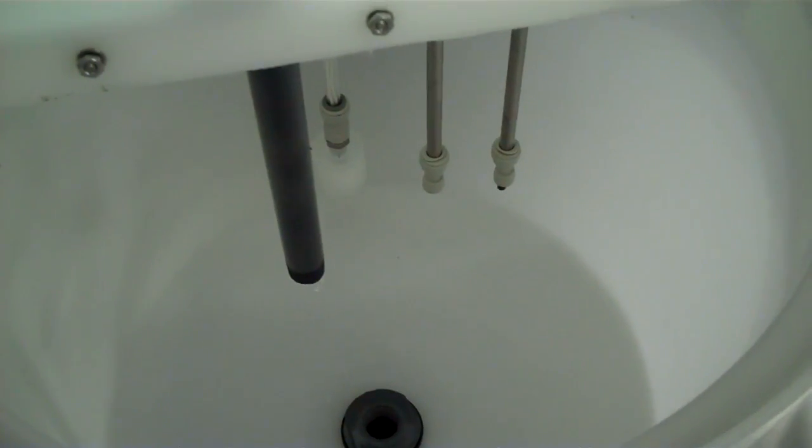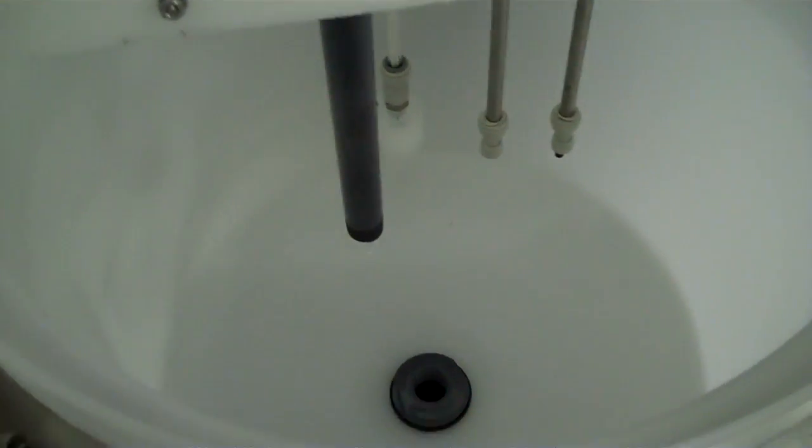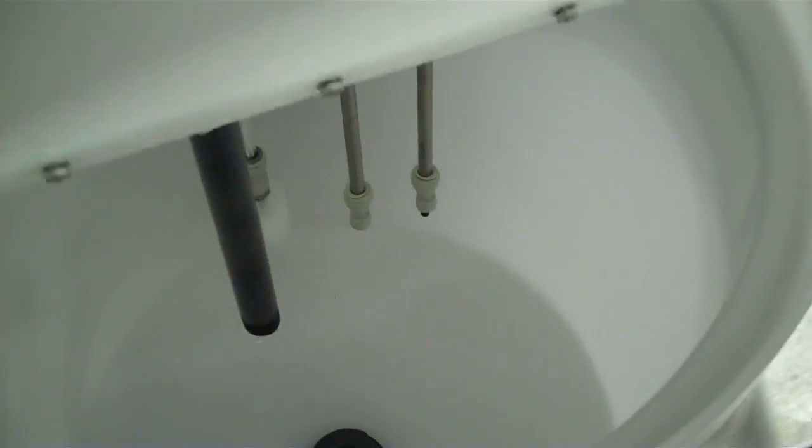Here's the back. This is the tank and you can see the feed flow tank. It's a plastic polyethylene tank with a hole in the bottom and feed flow.